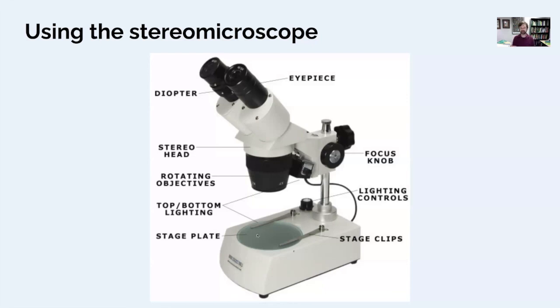So you put your item down here on the stage. The microscopes we have have options to light from below or light from above, or actually a combination of both. So depending on what you're looking at, you want the light coming from the best way to view that.